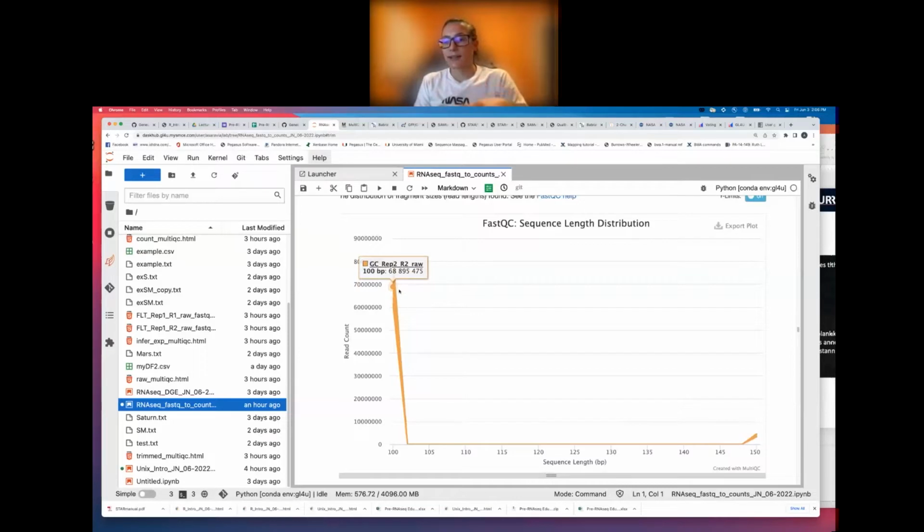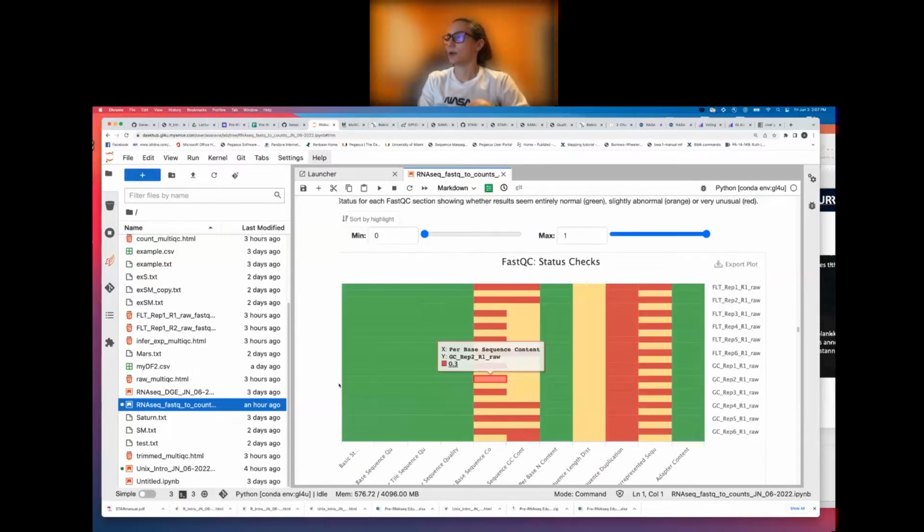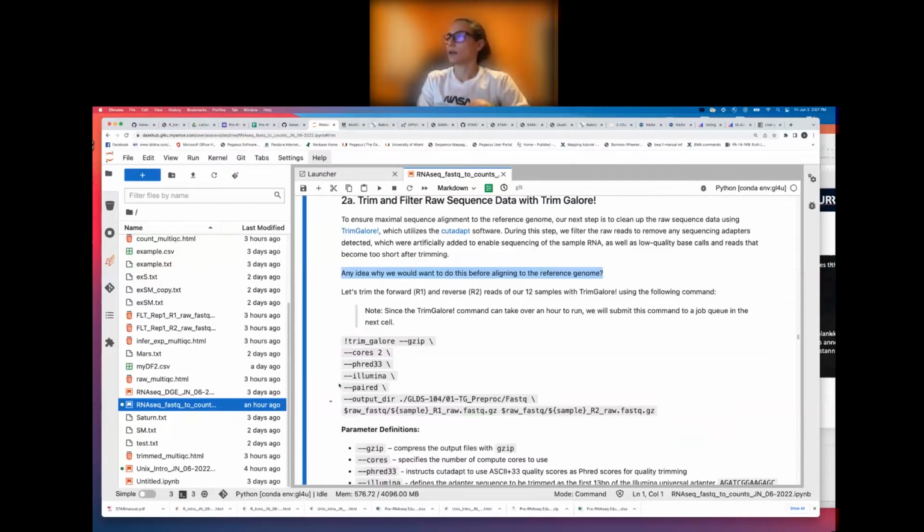So it's kind of like how when you make an error in your wet lab, but you make it to every single sample, when you're doing a comparative analysis, it kind of cancels out. Similar thing. Because we have a mix of roughly the same number of reads at 100 base pairs and roughly the same number of reads at 150 base pairs for every single sample, we decided just to keep all the reads and go with it. Again, this is uncommon. You should see with your raw data just one read length for every single read. So good thing to point out the weird data.